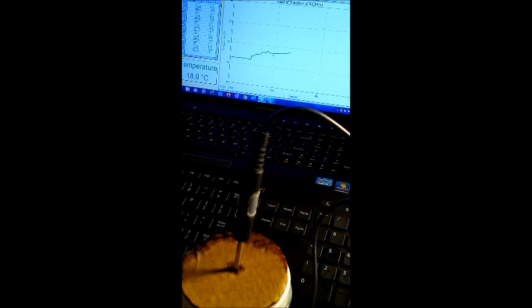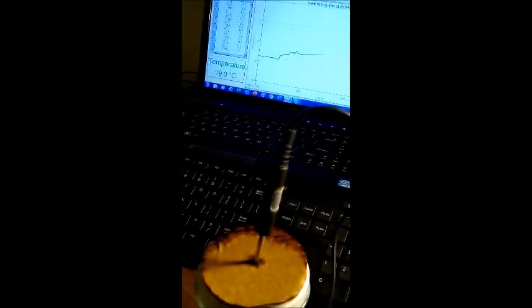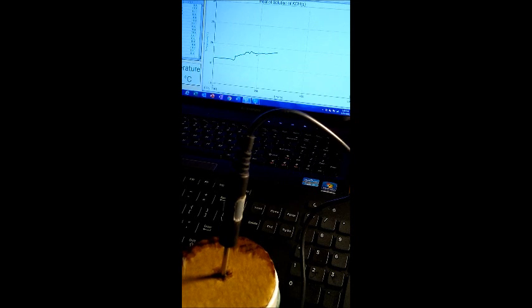And the temperature's going up a little bit more. Let's just give it another minute or two. I'm going to have to post trial 2, when I'm running KCl, potassium chloride, instead of KOH, in another video. I'm already at 12 minutes, so I know this video will not fit on Canvas directly. I will have to upload this to YouTube.